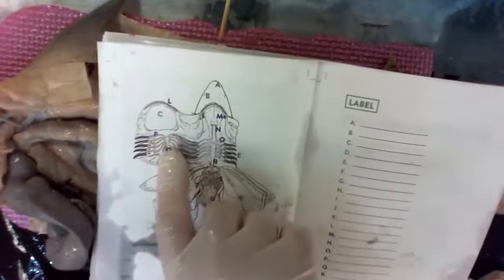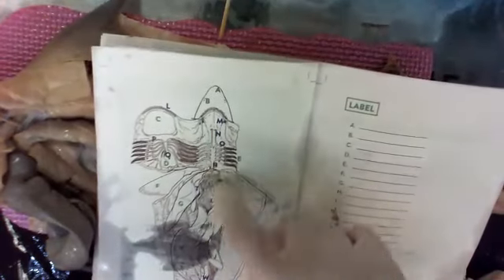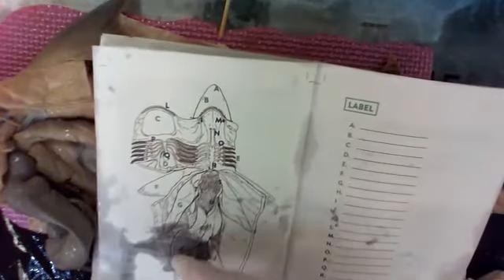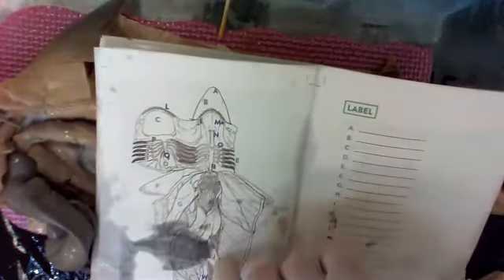The purples are a little more challenging, like what were those little blood vessels that leave the Q, something aorta, goes out, goes to the gills, comes back fresh oxygenated. You can see the papilla, you can see the rugae, you can see the spiral here. You can see this thing that makes blood. You can see that gland that collects salt.